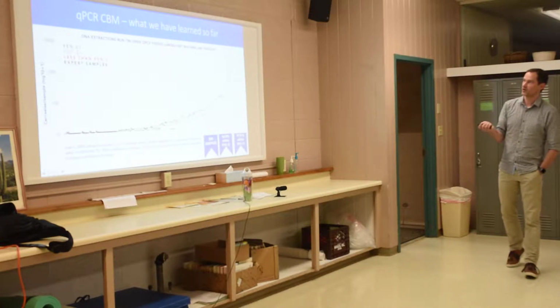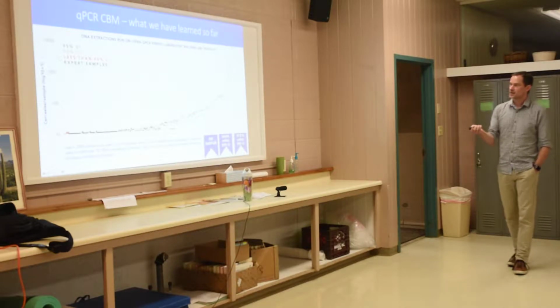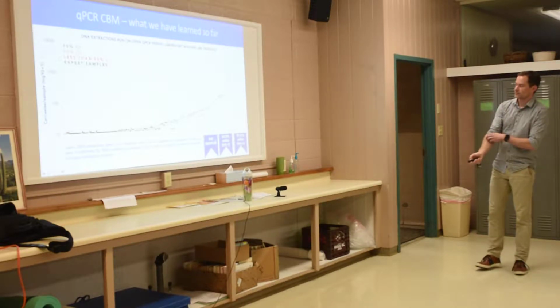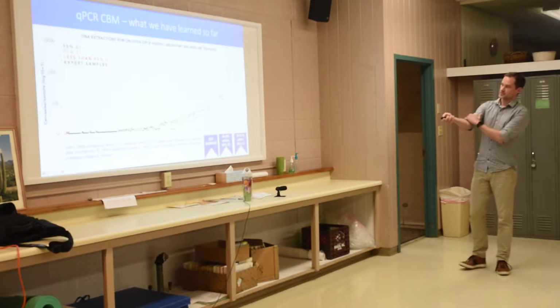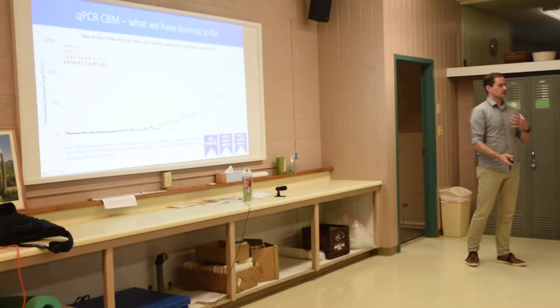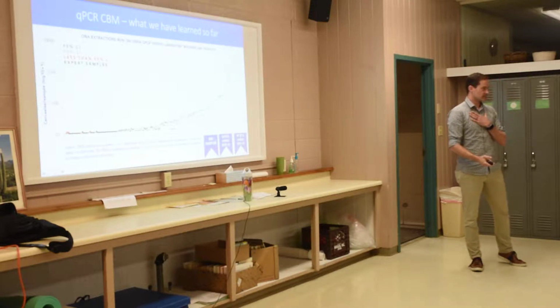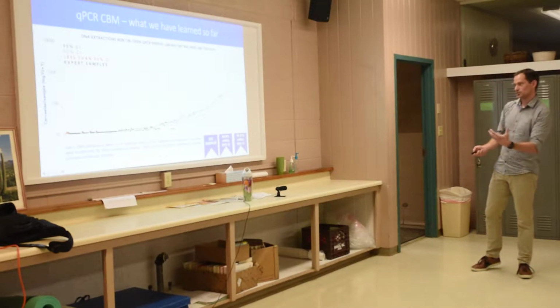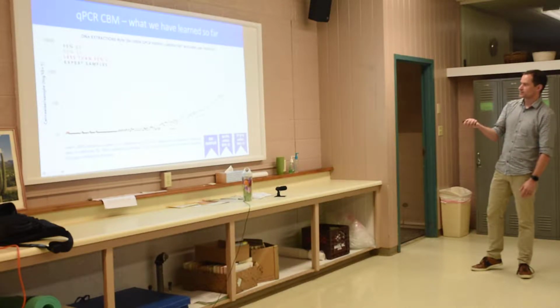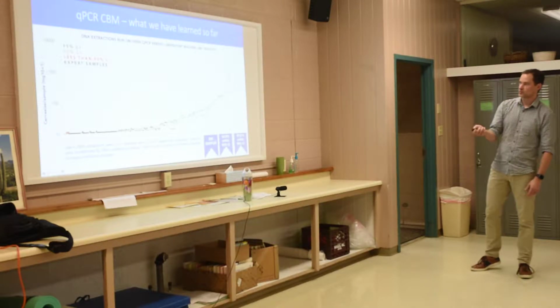So this is some data from our Swimmer's Itch CBM project, where these are just all different samples. Okay, so there's not really any x-axis, and this is just the number of cercariae that we've estimated in that sample using our little formula. What I want to emphasize here is that this black line that you see going up is the value for each of those samples that we get in the lab at the University of Alberta. So with Sydney, she's good at qPCR. And then these little dots are the values that Ron gets in the Freshwater Solutions lab.